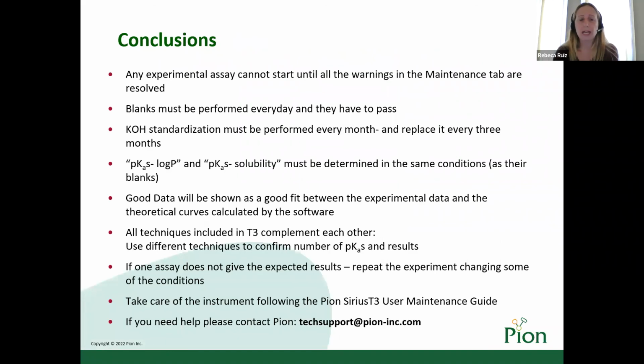So we are now on the last slide. Any experimental assay cannot start until the warnings and the maintenance tab are resolved. Blank must be performed every day and they have to pass. KOH standardization must be performed every month and replaced every 3 months. Log P's, pKa's and solubility must be determined in the same conditions as their blanks.